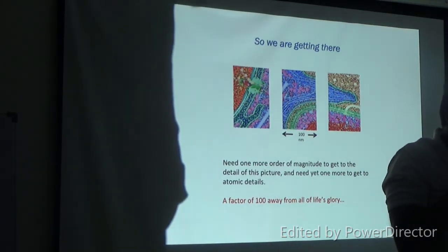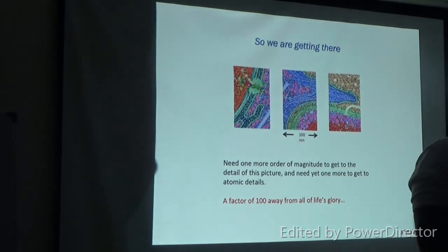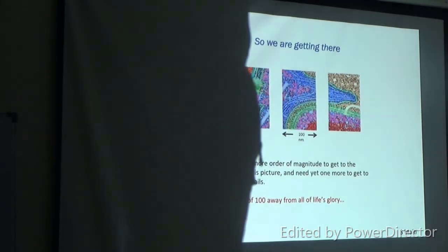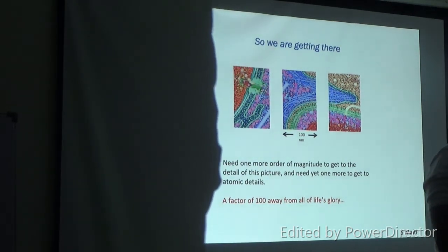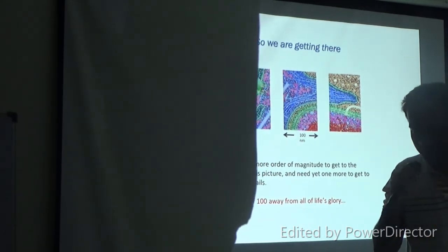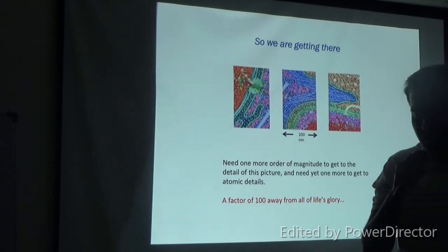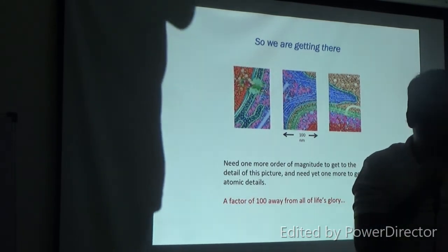So that's what I had to say to you today. To recap, we learned about the diffraction limit of light microscopy. We learned about fluorescence, which you can use to look at structures inside cells. But just static structures, that's not very satisfying. So we use GFP technology to look at dynamics in living cells. And finally, with STED and STORM, we tried to push the limits of light microscopy down to tens of nanometer resolution. And this is what has recently been very exciting and has been exciting many people.